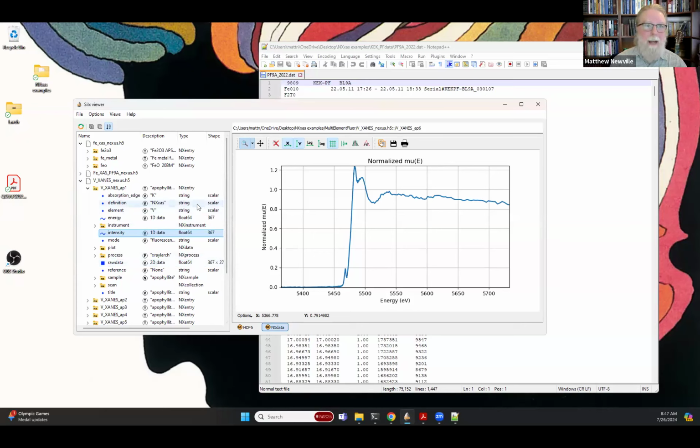I'll say the same actually for fluorescence XAFS. So most people who collect fluorescence XAFS with a multi-element detector are collecting single binned ROIs and calling that iron K alpha from MCA1. But that's not necessary. You could collect the full XRF spectra at each point, do a fit, and extract that later. And if you want to include all of that data into a single spectrum and then have it be complicated, you can. Actually, the raw data here, you can have multiple raw data sets. You're not restricted to one.